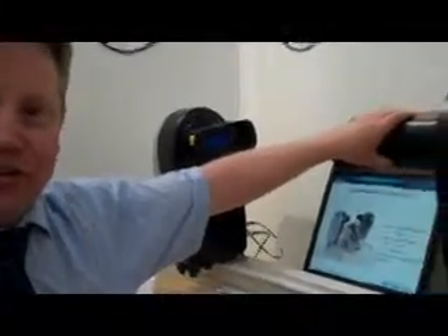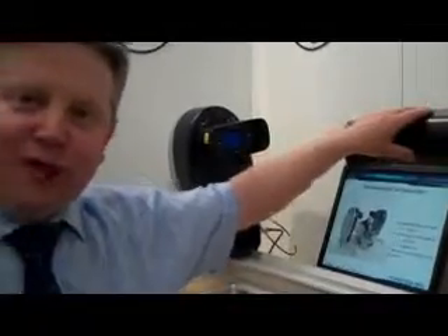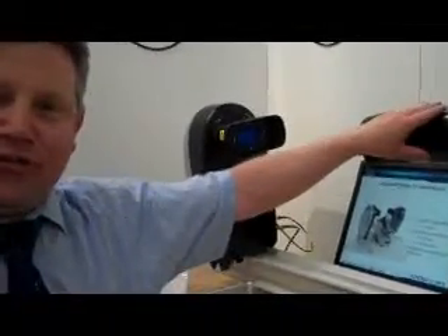We collect the scattered light using this lens here. This is a 300 millimetre lens, which allows us to size from 0.1 to 900 microns. But we can also have a 750 millimetre lens that allows us to cover the range from 2 to 2,000 microns.